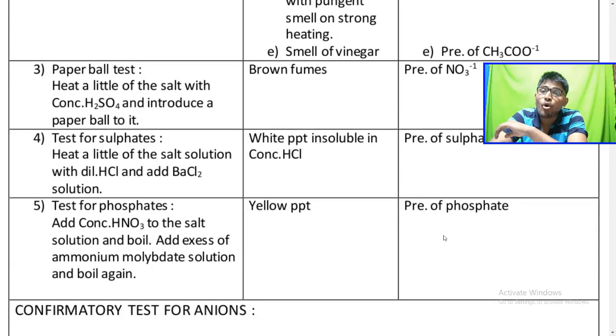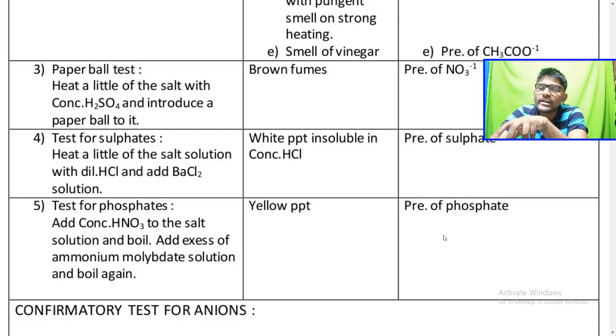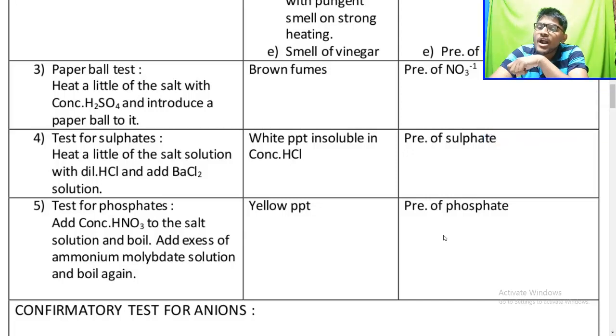Paper ball test is also an option which is basically not used in the examination, but you can refer to the notes. Test for sulphates. Yes, the test for sulphate is very important.